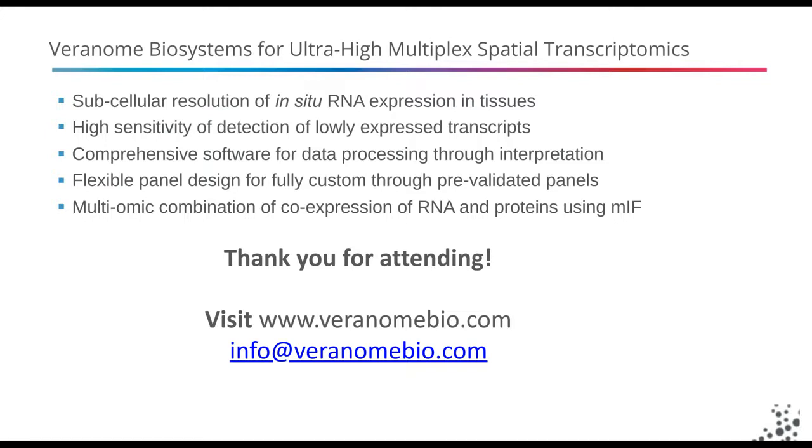Yeah, that's a really great question on heterogeneity. Since we have the single cell resolution, we can examine the entire cell by gene matrix and determine subsets of cells of interest and look at their expression patterns. From the matrix, you can look at expression signatures or normalized expression values. And these can be compared for cells that are adjacent or within the same brain region or even across different regions. And since we have the spatial information, we can actually select cells or regions from the image and examine heterogeneity that way at a very high level of resolution. And do so around, say, neurodegenerative plaques or areas of inflammation. So it's a lot of great tools for that.